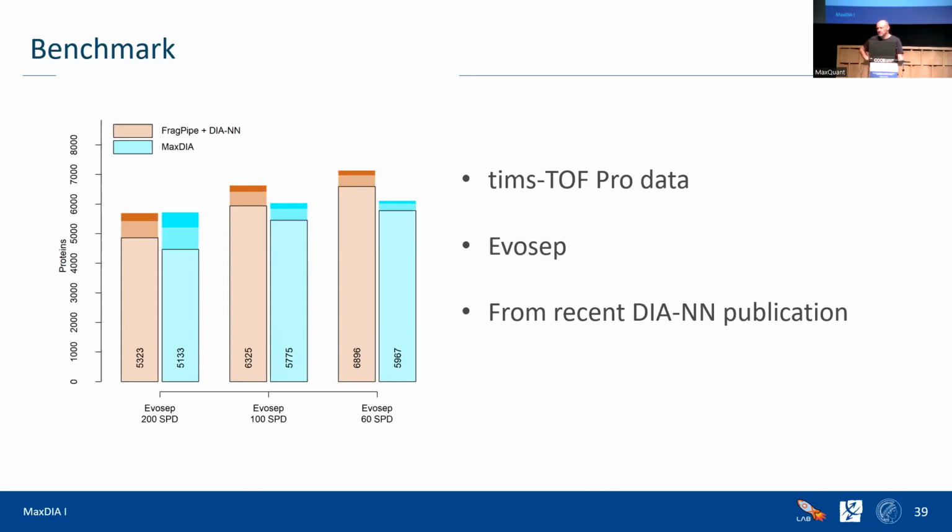It doesn't happen as much in normal DDA, but it happens there also, just not so often. In the search engine, for example, it happens sometimes. Unfortunately, it's not predictable which algorithm exactly is doing this, but it's more a generic thing. You see it more in DIA because so far you didn't have so much time to look at the processors running, which is not the case anymore, and I think you just see it more often there. Okay, great. Thank you very much.